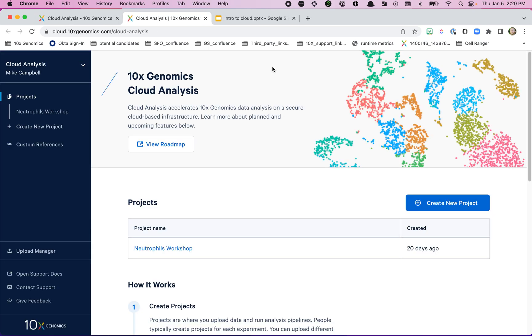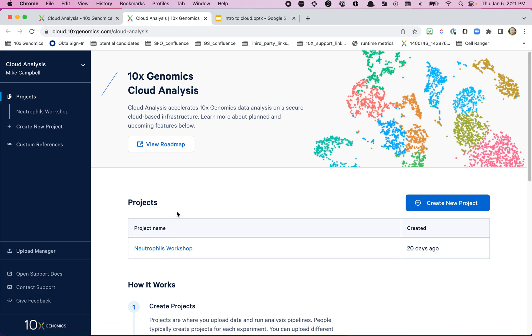Since I've recently signed in, it remembered that and signed me right in. When you sign in, you'll first see an option to sign in with Google or make a username and password. Click through that and it brings you to a page similar to this. I do have one thing on this page that won't be there for you when you first sign up — this project. You start out with no projects, but that's not a problem; I'll show you how to create projects.